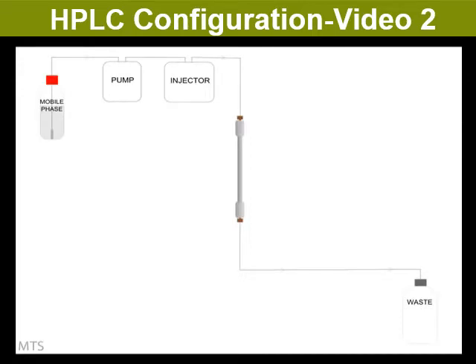This instrument is designed to inject a small aliquot of sample, typically in the order of a few microliters, into the flow path of the mobile phase prior to the column. It has to do this without altering or stopping the flow of the mobile phase, and thus maintaining the system pressure. In most modern systems, this process is automated, and samples are placed in vials which can be injected by the autosampler in the order and amounts programmed by the operator.